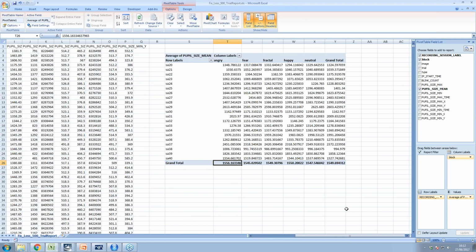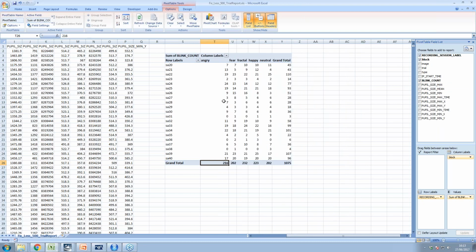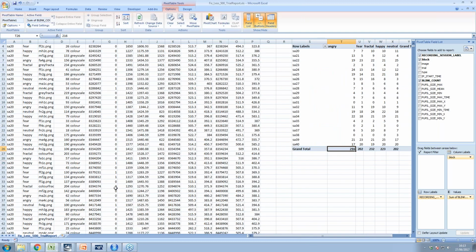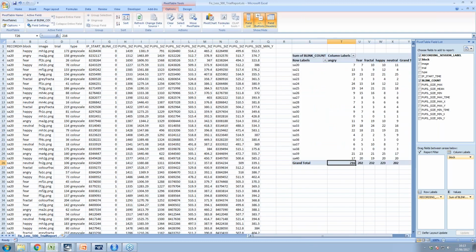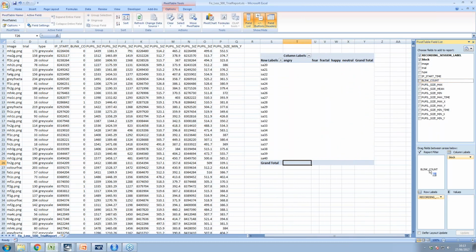However, we might just want to check, you know, are any of these averages taking in data that happens to come from a point at which somebody blinked within that baselining session. So we could, for example, quickly look at blink count, and you can see that there are in fact blinks within that time. Not often, but some. So we may want to then use a filter.